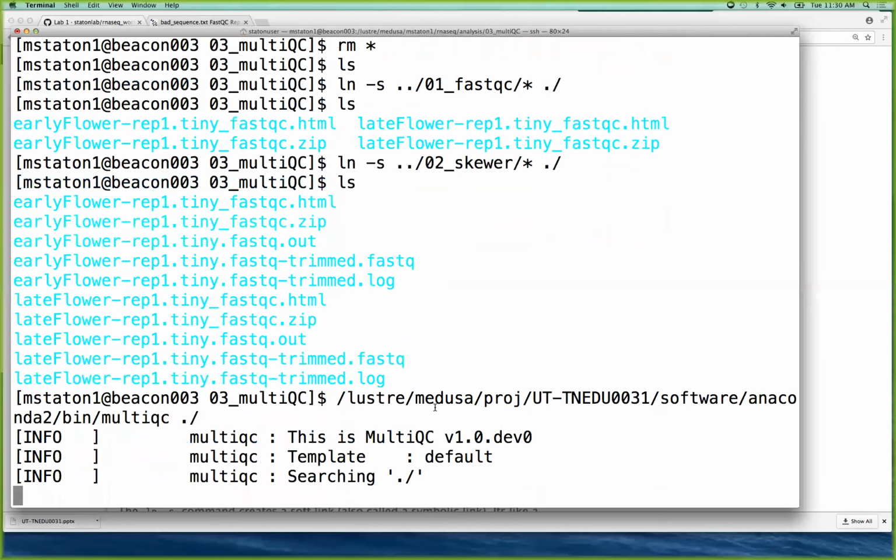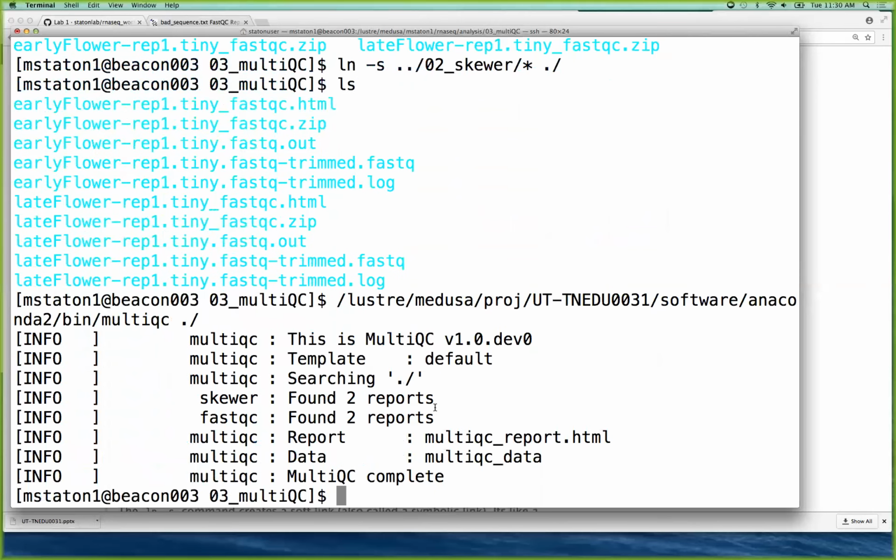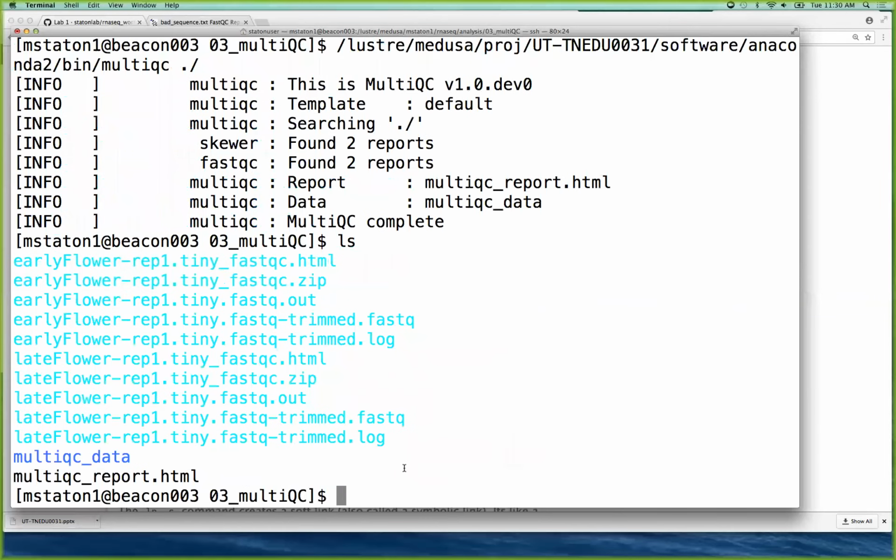Great, so we're essentially out of time. If you have time to let this run and complete, that's great. The homework for tonight was to send me your multi-QC file, which we won't get to FileZilla today, or secure copy, the preferred way to transfer files. So we'll do that tomorrow morning, and then you can just email me your files. So don't worry about emailing your multi-QC file unless you're just super savvy and know how to move them around. But once it completes, I think you guys are good to go. But hang out if you have any questions or want more clarifications. I've had a number of people asking more details about how the software works. So you can definitely go through that. And, yep, thank you.